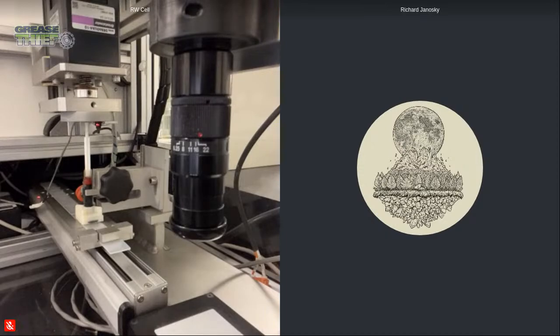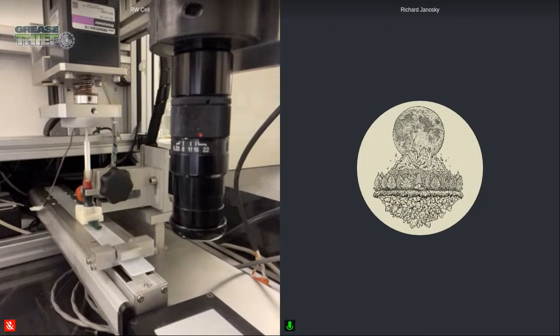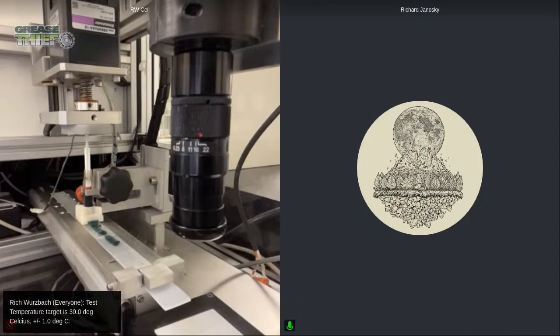Okay. So we just hit our test temperature. So I'm going to go ahead and on the screen on the outside, I'll hit start. And then our test will start to run. At first, it'll be just doing the fill at the beginning of the load profile. This is just making sure that grease is coming out of the extrusion die as well. And then it's going to go through 3 different speeds to test load profiles or how it reacts. So right there, we see it looks like it slows down for a moment. It almost doesn't look like it's moving just because of that speed change.